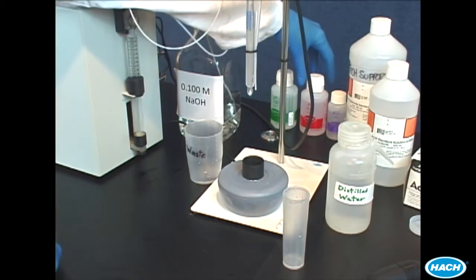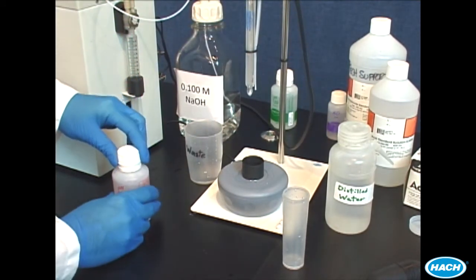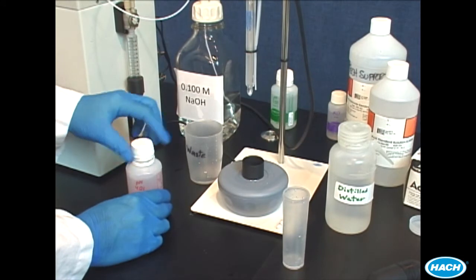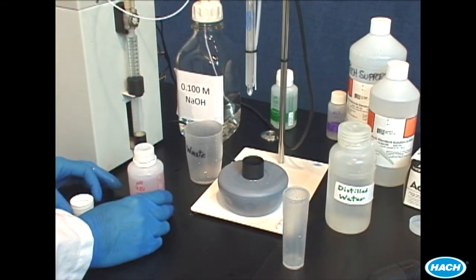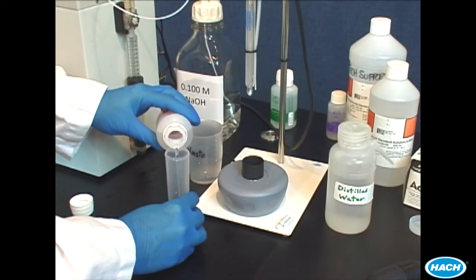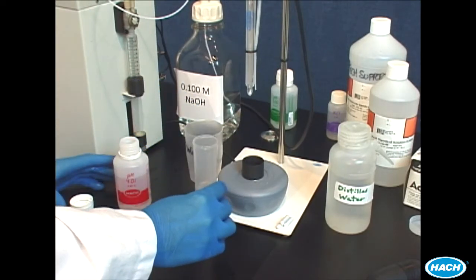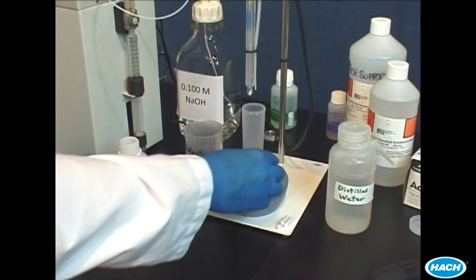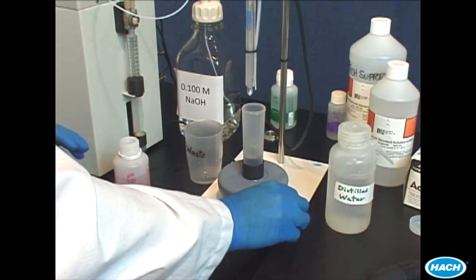We will now calibrate the electrode using pH 4 and 7 buffers. For best results this should be done at least once a day. Pour about 10 milliliters of pH 4 buffer into a titration cell. Add a magnetic stir bar.